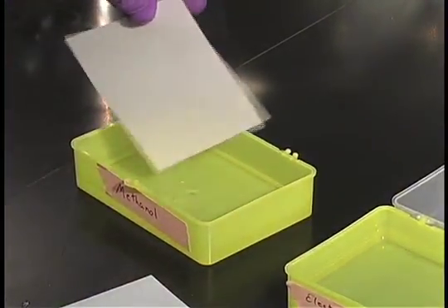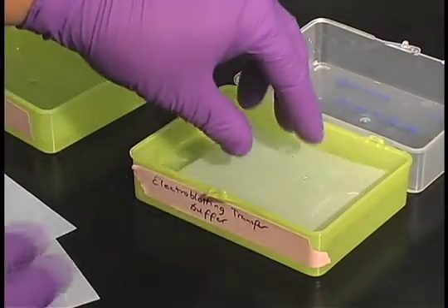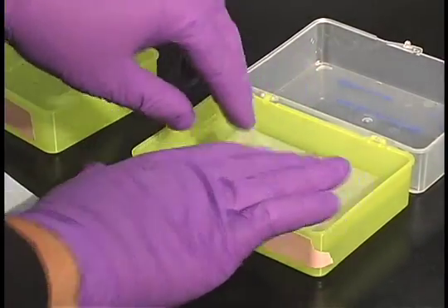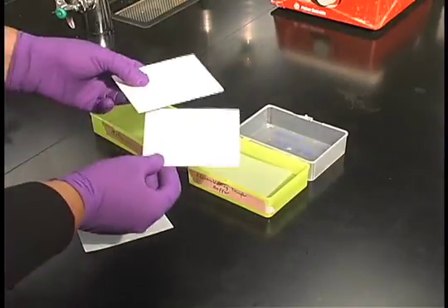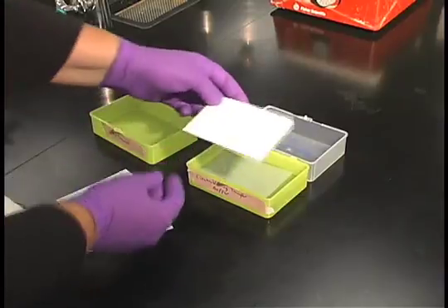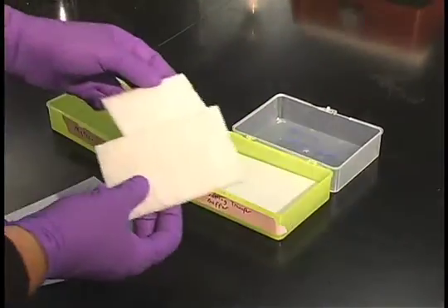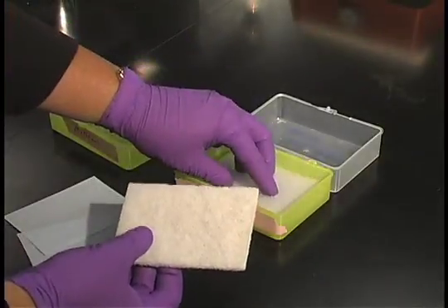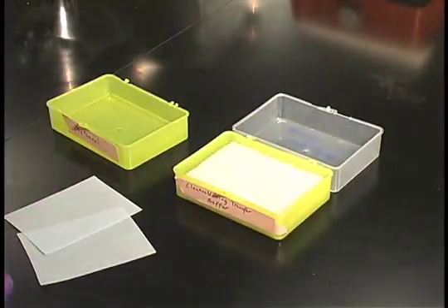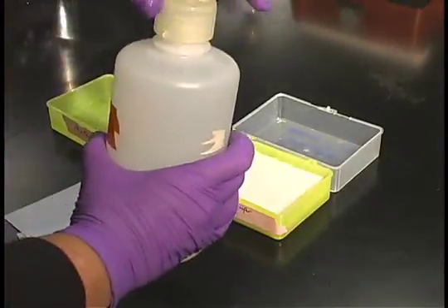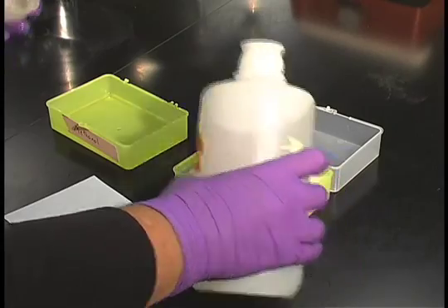Then we'll soak the paper in electroblotting transfer buffer, along with two pieces of absorbent filter paper and two fiber pads. Add more buffer if you need it to cover.